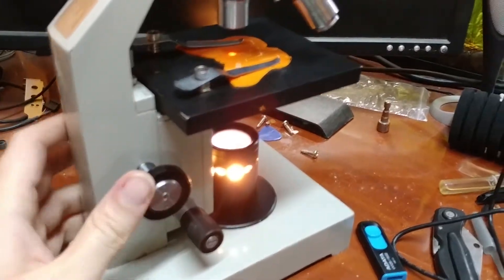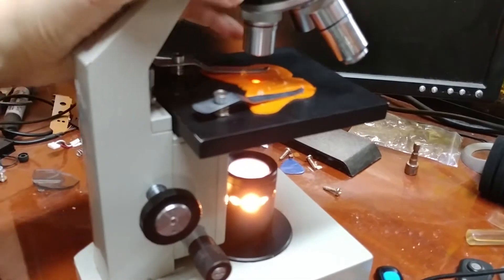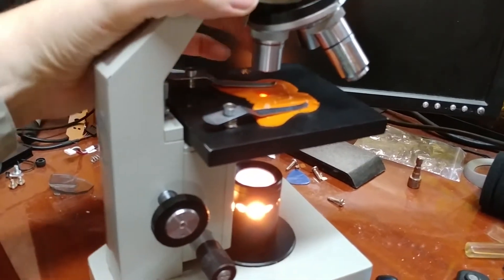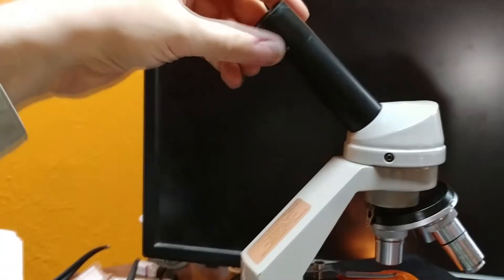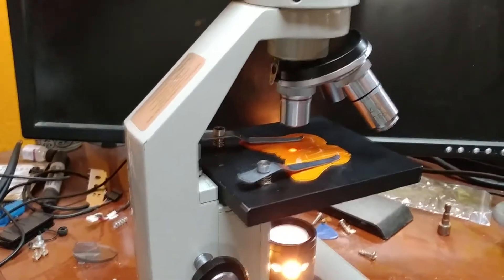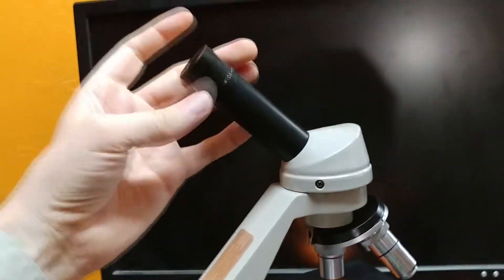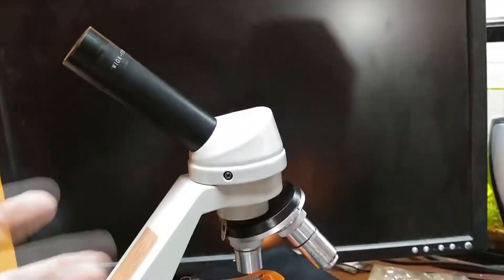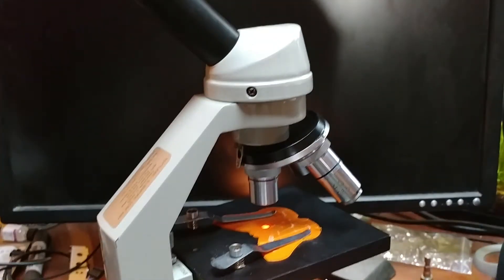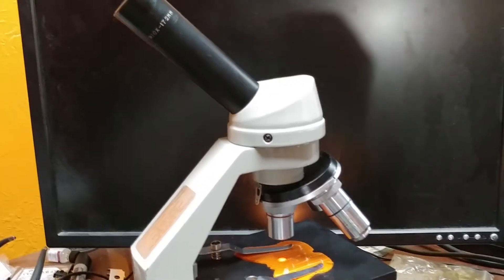$18 for a microscope is not bad. This one is not the best microscope in the world. It's got a 4x magnifier, a 10x, and a 40x combined with the 10x eyepiece, so this is a maximum 400x microscope by default. You can get replacement eyepieces — I think you can get them that go up to 30x, so you can make this a 1,200x, but that's not really what I'm going to use it for.